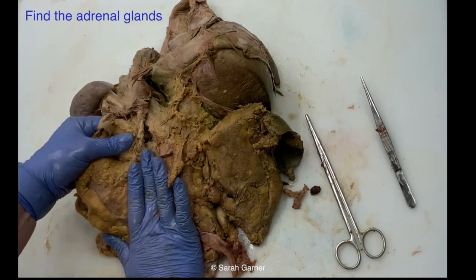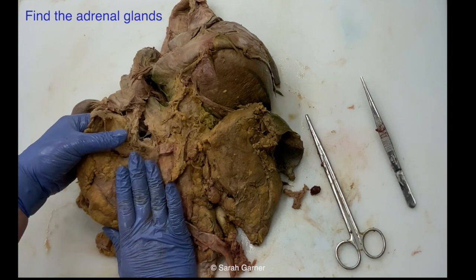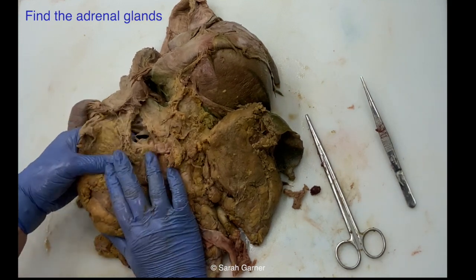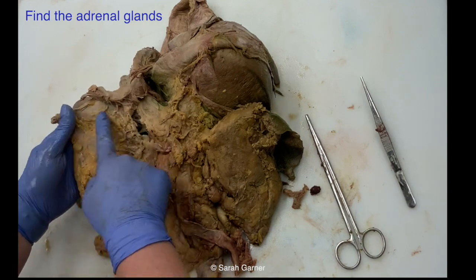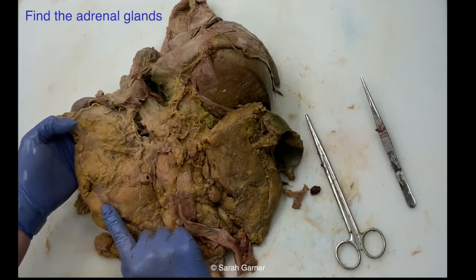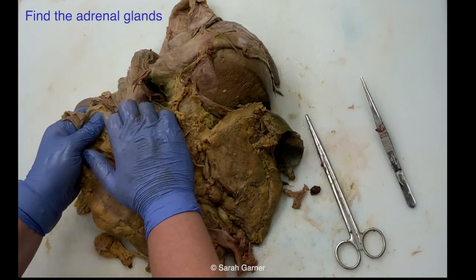So again, I was told that it's like magic when you're just palpating, and you feel it here, right? So I can feel the difference. Again, if you're looking at that, you probably don't see the adrenal gland. I can see a little bit right there, but if you don't know what you're looking for, and especially if it's fresh, it's a lot more difficult to find.